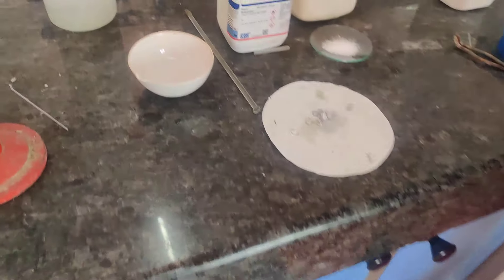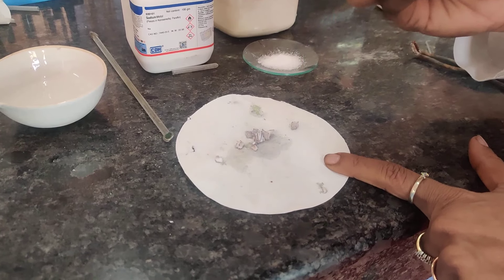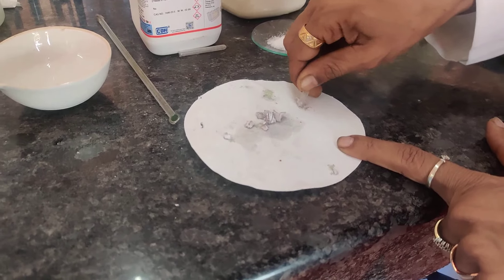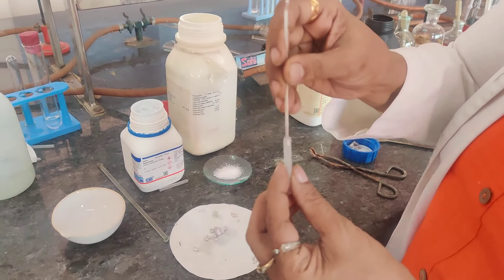This is my sodium metal in small pieces. This is a special tube known as the ignition tube — it is a small tube. From the sodium metal, I will be taking a small piece of sodium into my ignition tube, and then I need to push it into the ignition tube with the help of a capillary, just pushing it in.